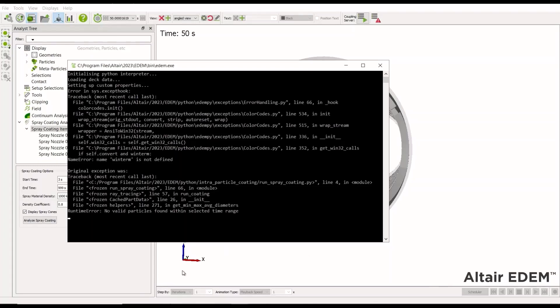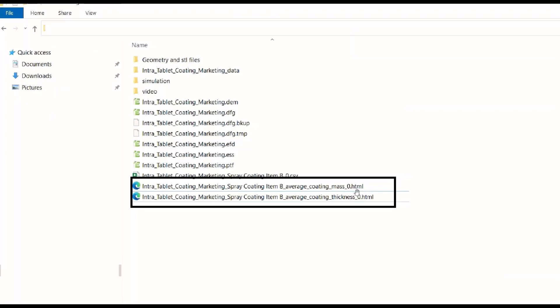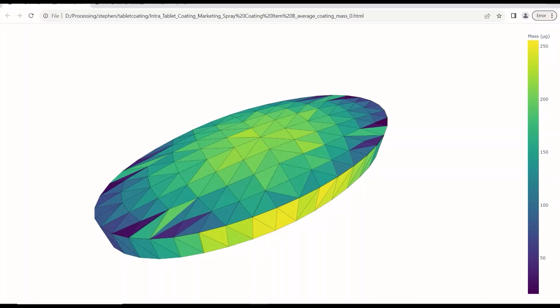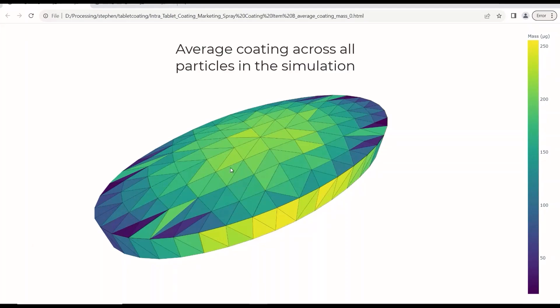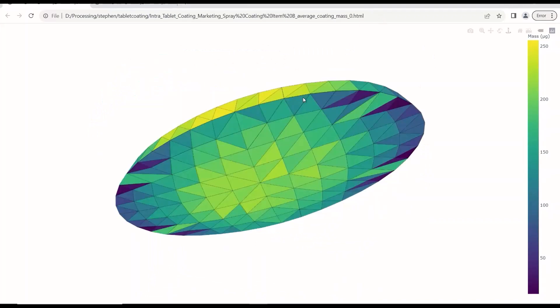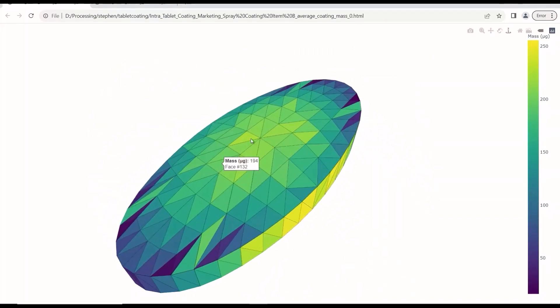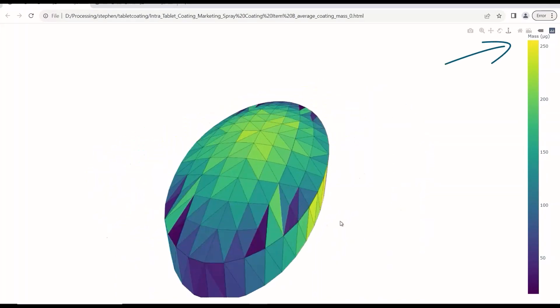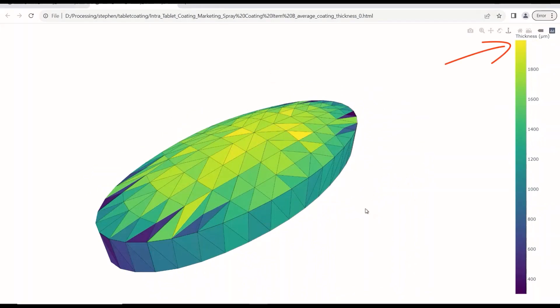We also have a series of HTML pages where we can see the simulation results. These HTML files are in the same folder as the simulation .dem file, and you can see the mass and thickness specified in the file names. Opening them in a web browser, we can see the tablet displaying an average coating across all the particles, displayed on a representative polyhedral particle. We can interact with this and move around to look at the distribution — we have good coated coverage on the top, but maybe not as good around the edges relative to the top face. We also have the coating for thickness shown.